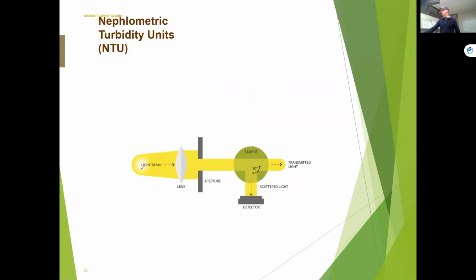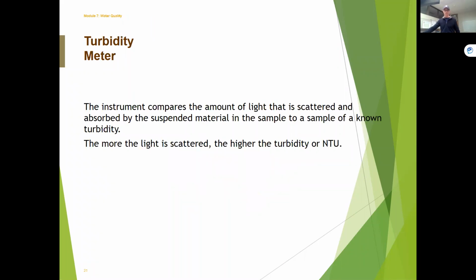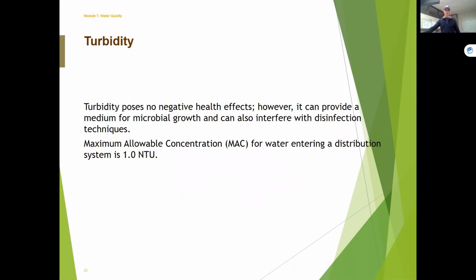But keep in mind, always 90 degrees. You can see how really easy it is for the vial to make your sample go right sideways. So make sure those vials are super clean. And we saw that earlier.